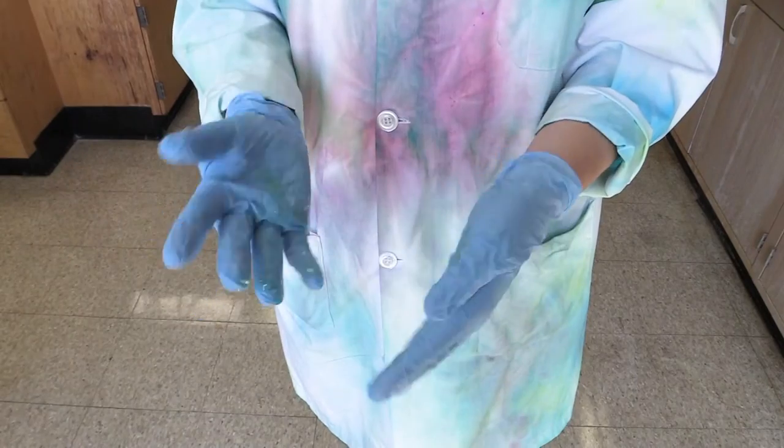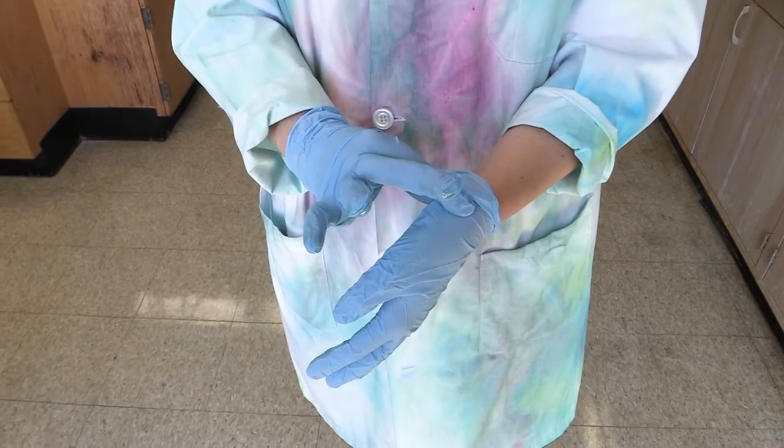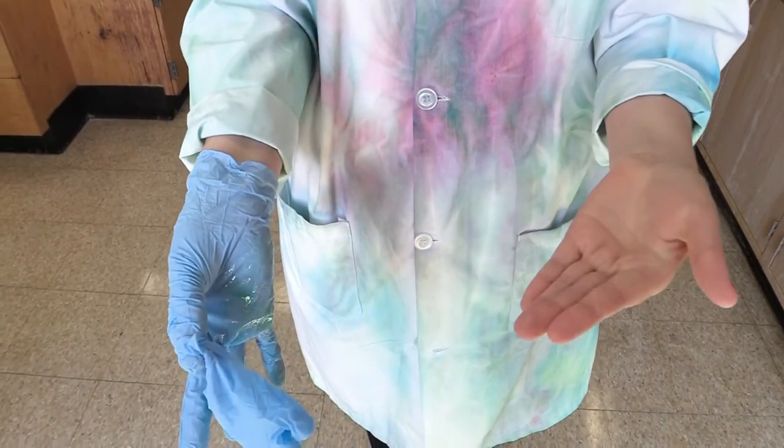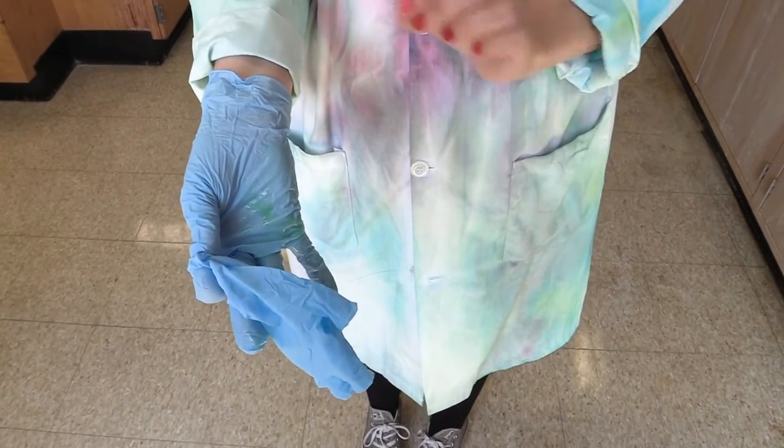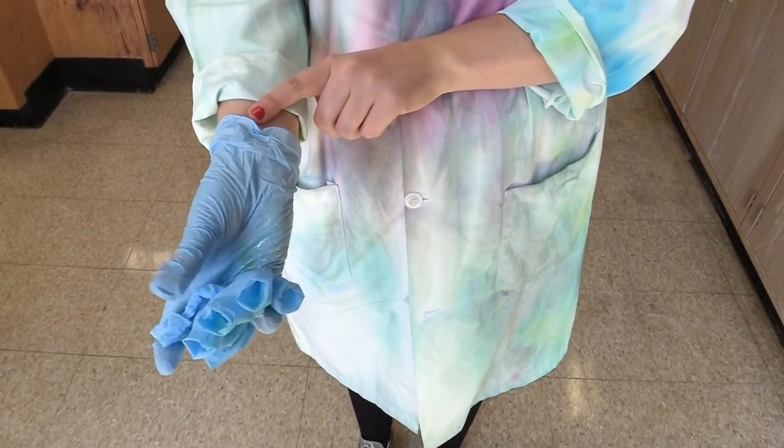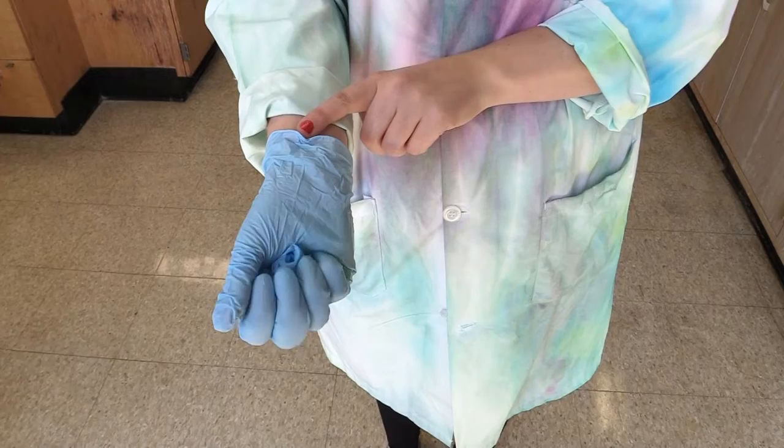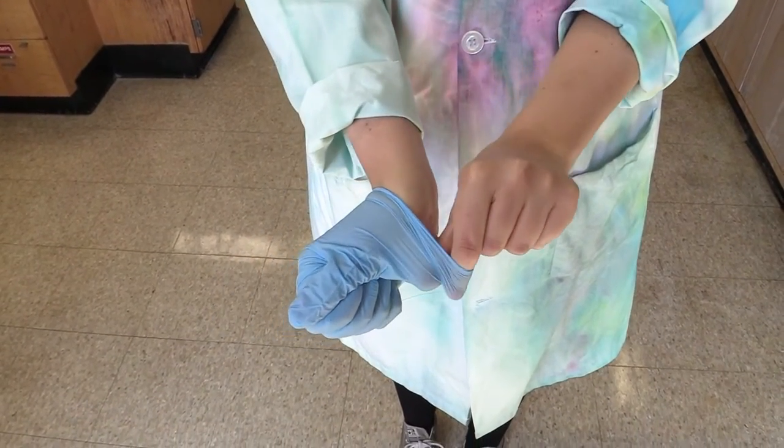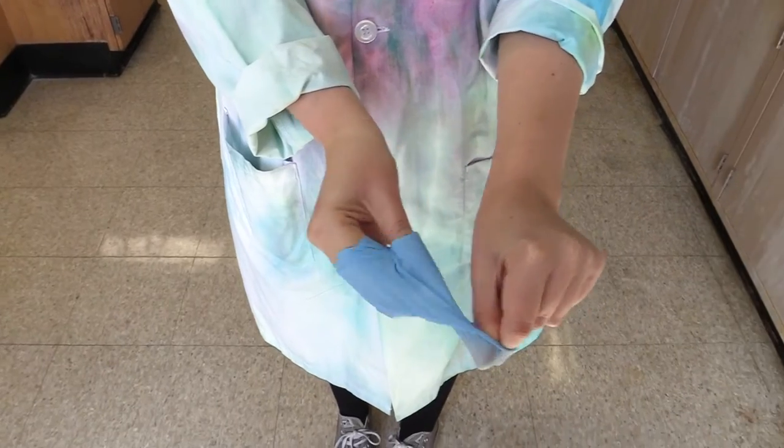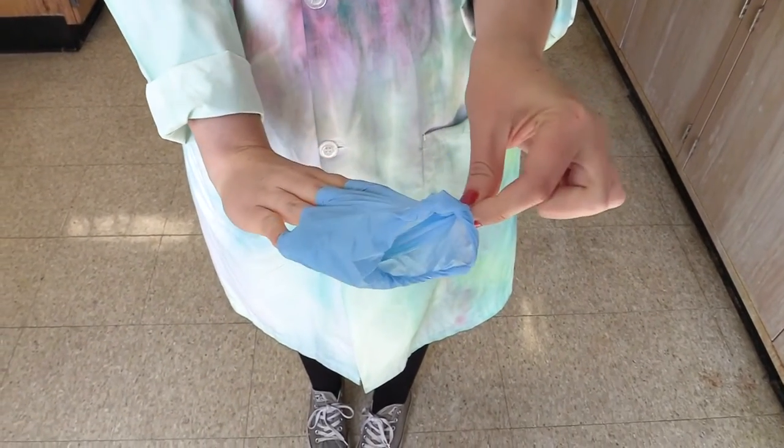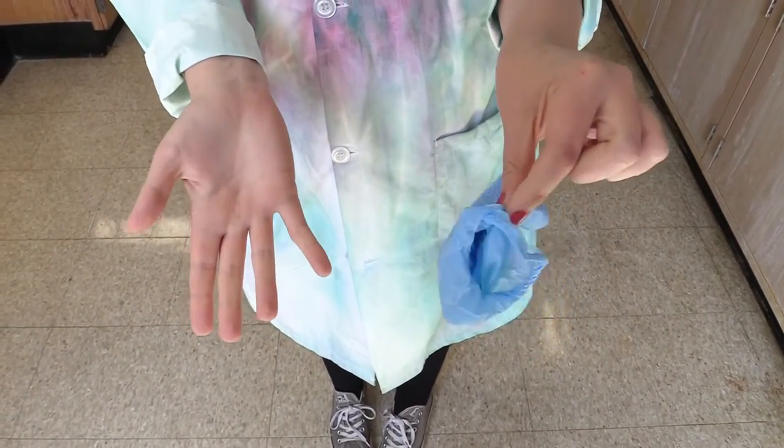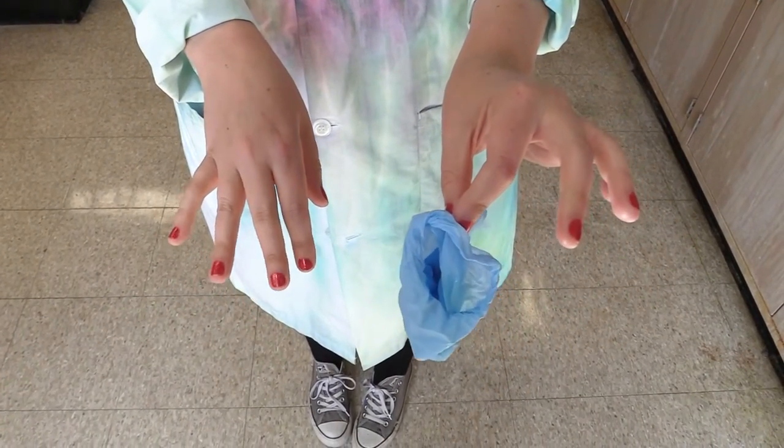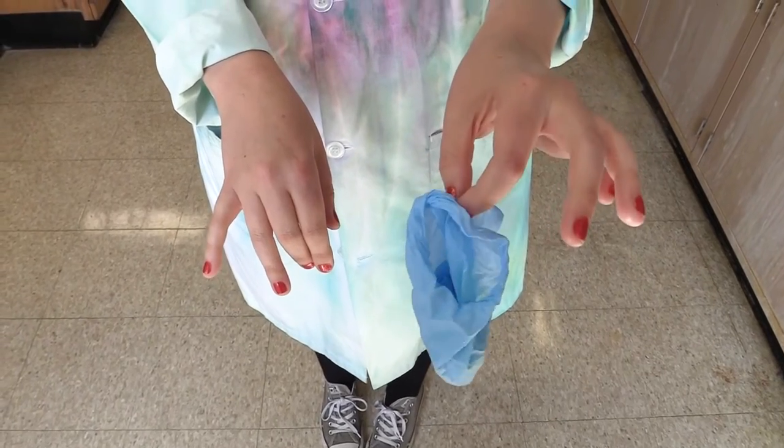When you go to take your gloves off, first pinch one of them somewhere around the wrist or at the base of your hand, and peel it off like this, turning it inside out as you go. Then, ball it up and hold onto it with your still-gloved hand. Next, scoop under the glove you're still wearing with your thumb or a finger, and peel the glove off again, turning it inside out as you go. This way, you're always touching the inside of the glove, never the outside. If you do this right, you'll package the first glove inside of the second.